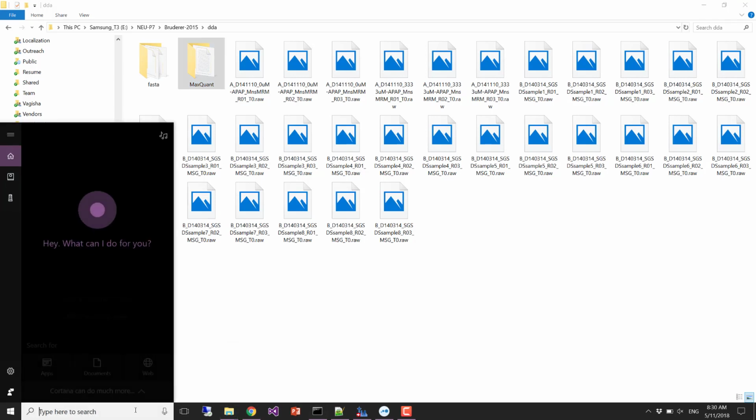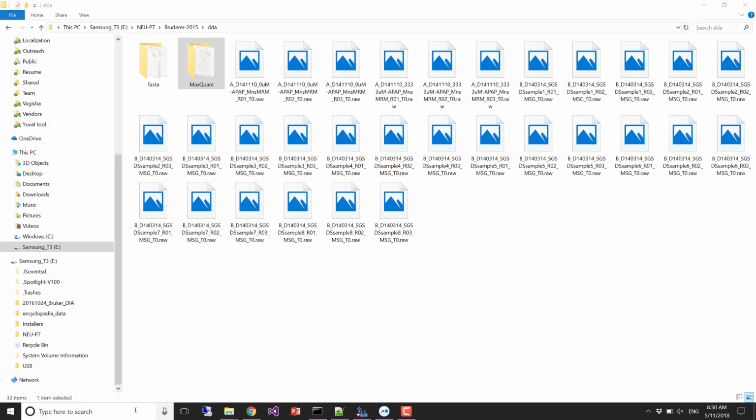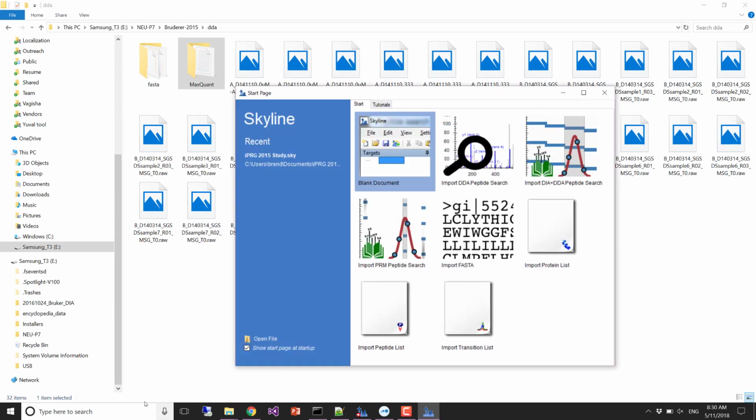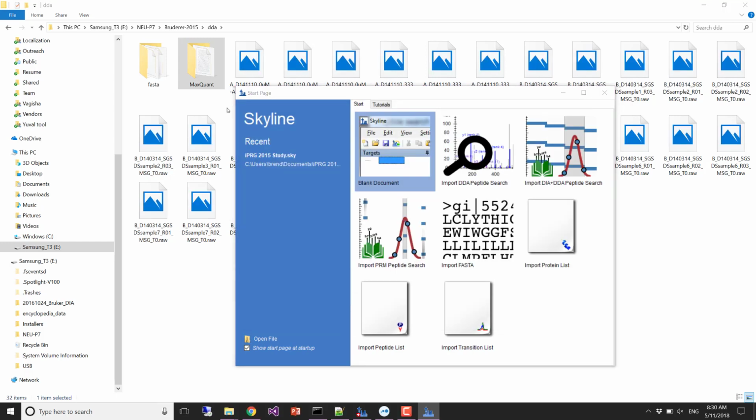I think for this part we can just start up Skyline. And let me see. Oh, I gotta get a different set of notes to follow. So I kind of walked you through, there's two proteins. Yeah, here we go. Two proteins imported.